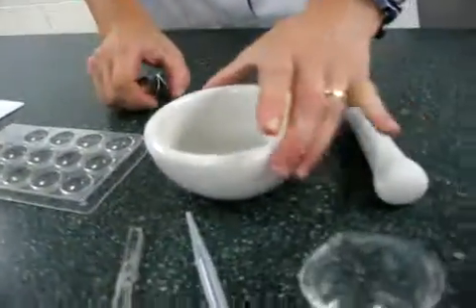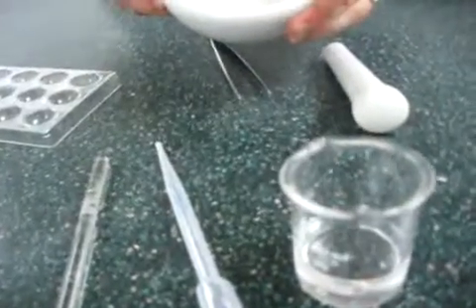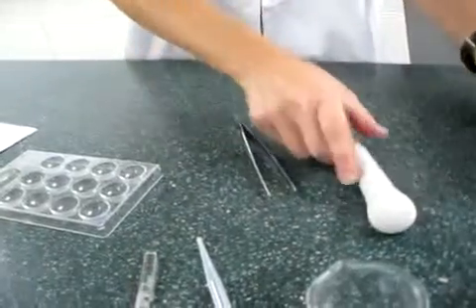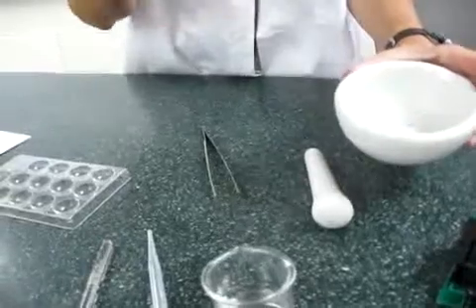From here, you will clean out your mortar and pestle, and you will repeat that test for the other compounds. You will clean it out with a paper towel and not your hand.